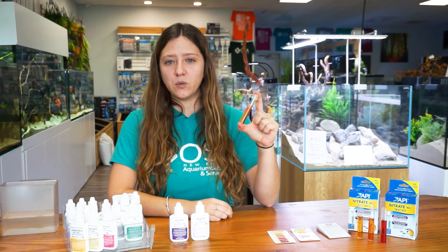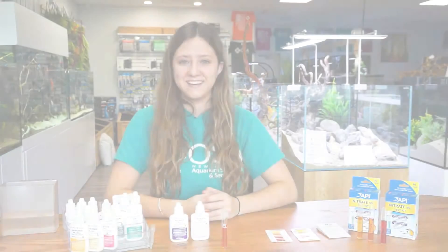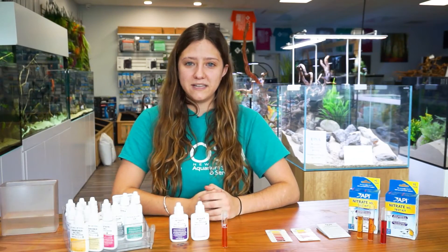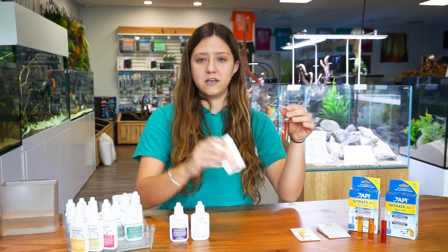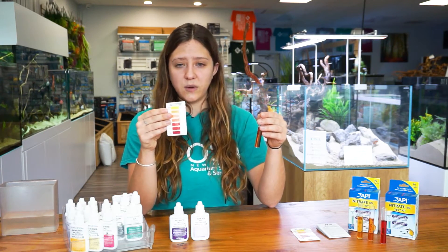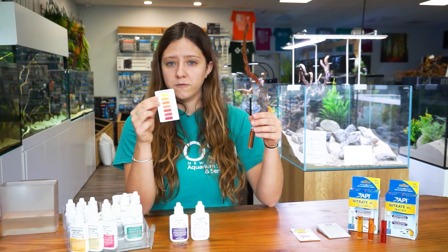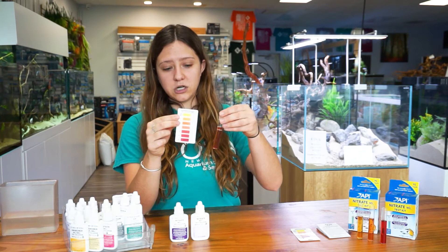After you shake your test tube for one minute, you are going to let the color develop for five minutes. Now it's been five minutes and we are ready to read our results. You are going to take your test tube and your corresponding color chart. The tests for fresh water and salt water do have different charts, so you want to make sure you are reading the correct chart for which water you are testing. We are doing fresh water here, so we are going to read it with the fresh water chart.